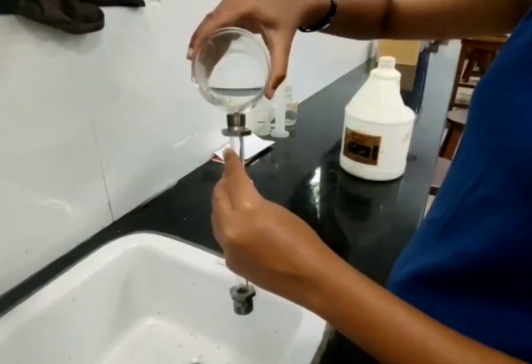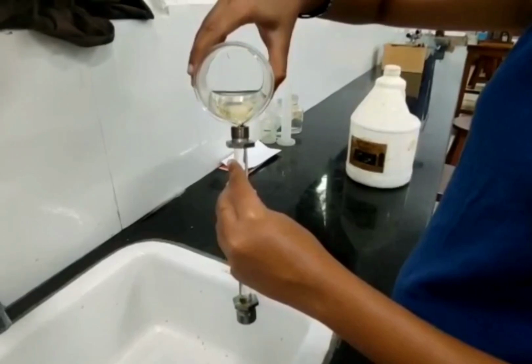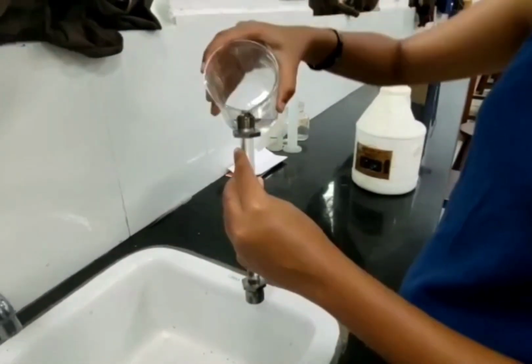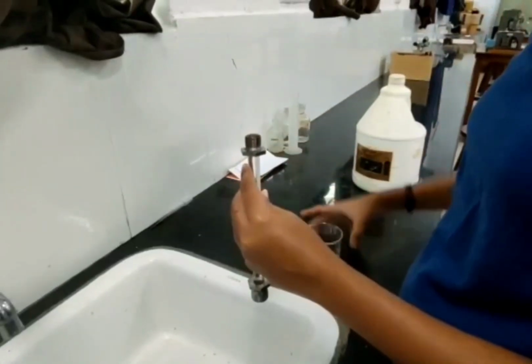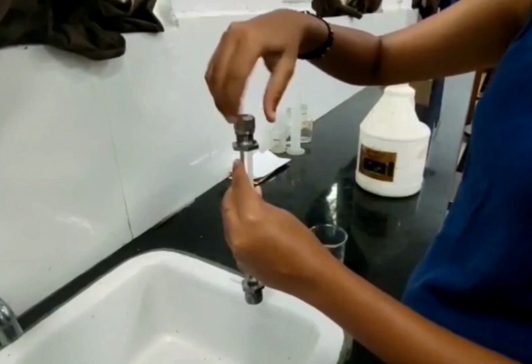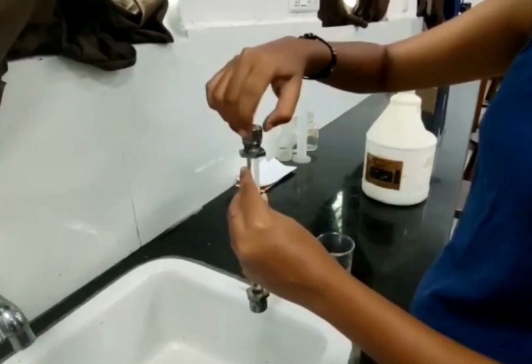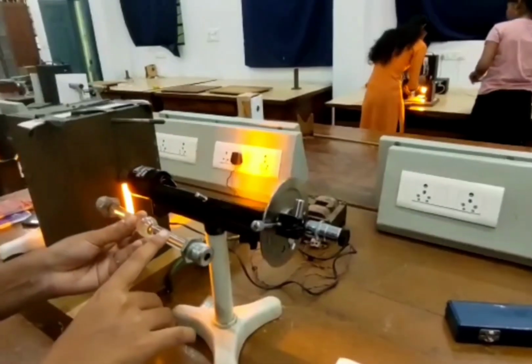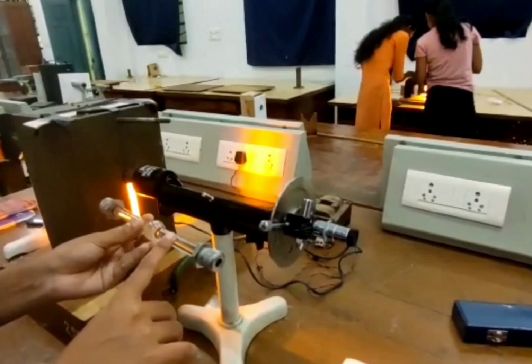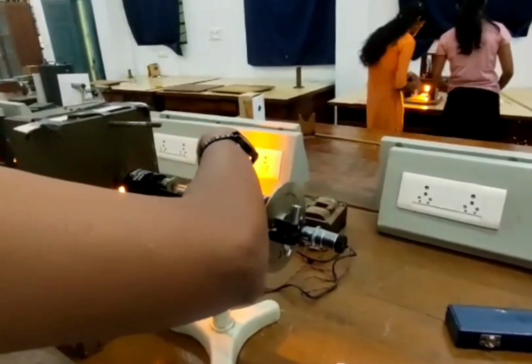We are filling the polarimeter tube with the sugar solution. At present, we have the polarimeter tube filled with 0.4 gram per centimeter cube. And now we are going to keep this inside the polarimeter.